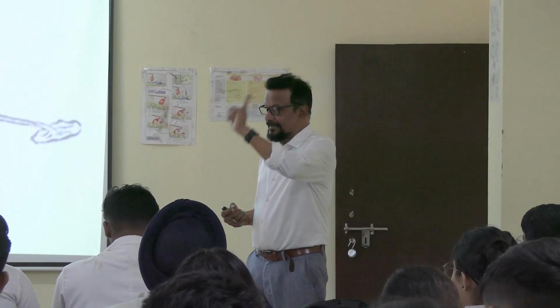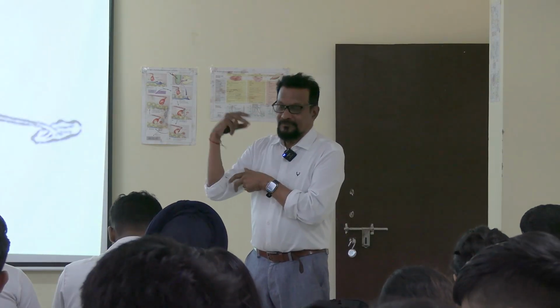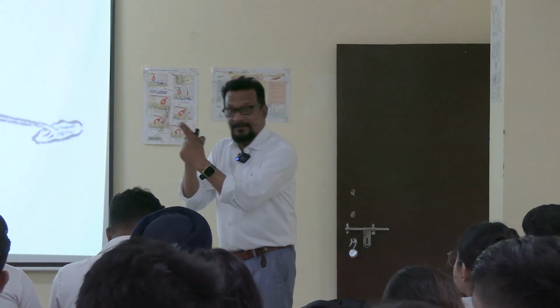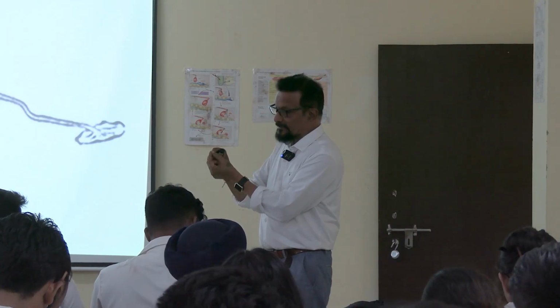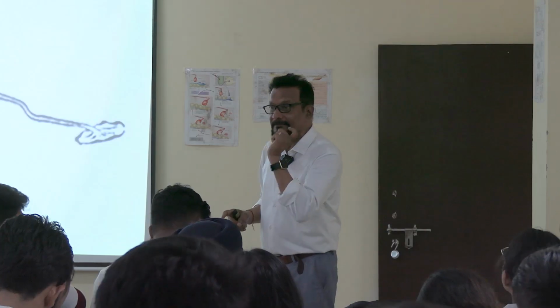Plus another factor, the inertia of the lever. So these are the causes of latent period. This is the delay: immediately after application of the stimulus, there is no immediate response. It responds after a certain time. Understand this? Is that okay?